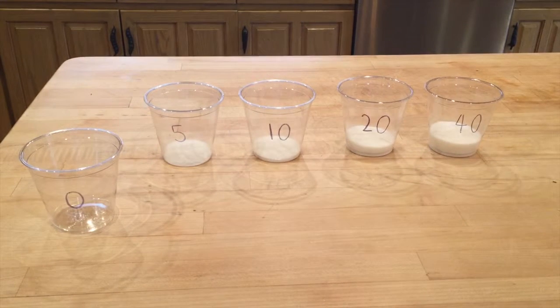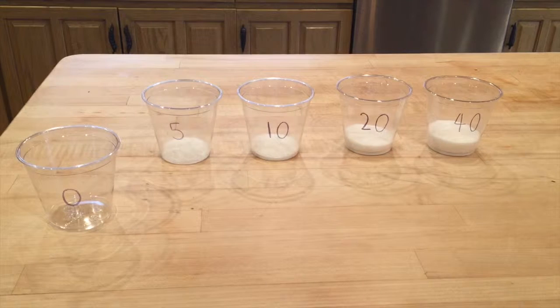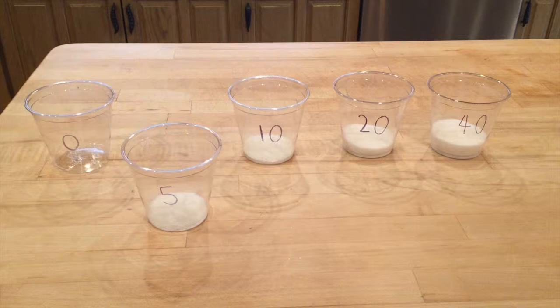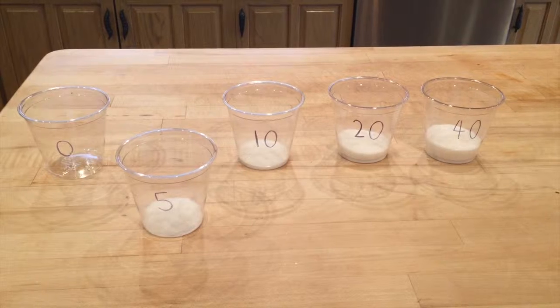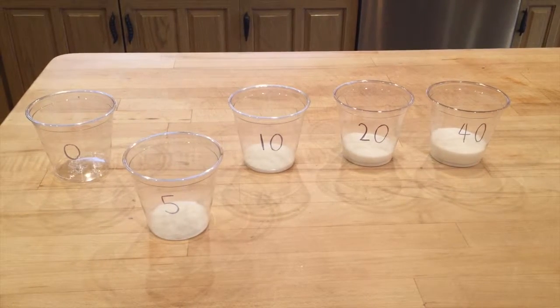In trial 1, 0 grams of salt were added to 100 milliliters of water. In trial 2, 5 grams of salt was added to 100 milliliters of water.